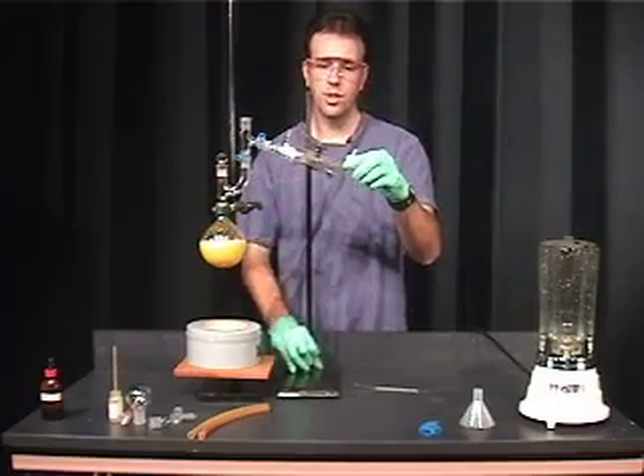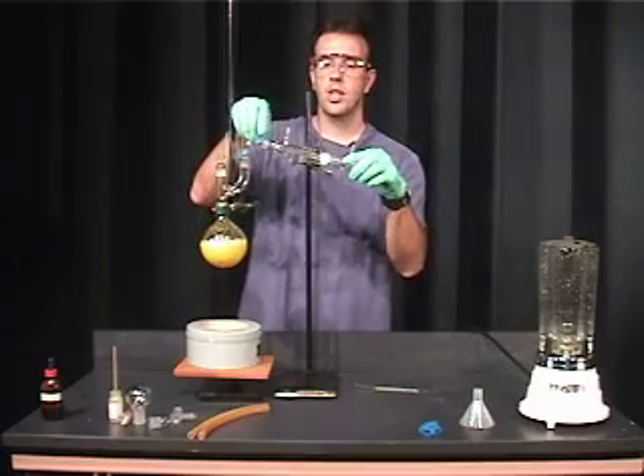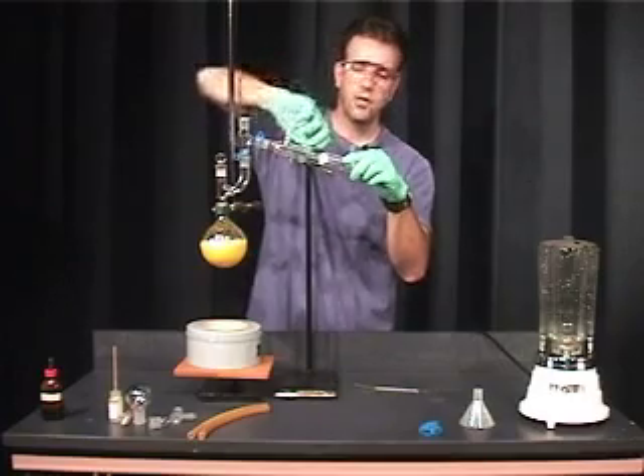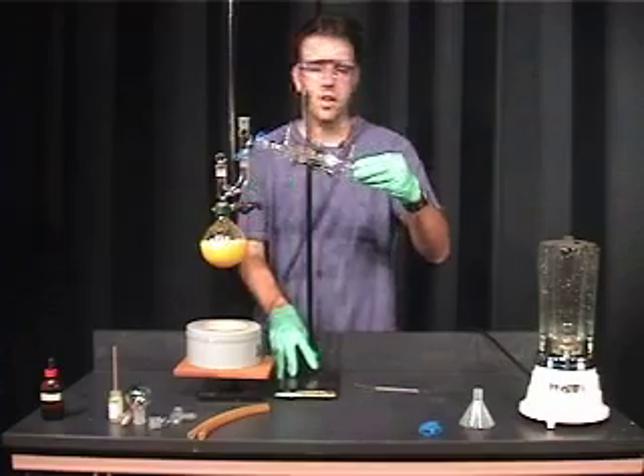Now we can secure this in the clamp. This joint is fairly secure now because of the joint clip. This clamp doesn't need to be tightened — it just needs to be secured very loosely. This is to provide balance and not very much for support.